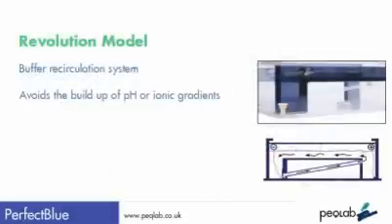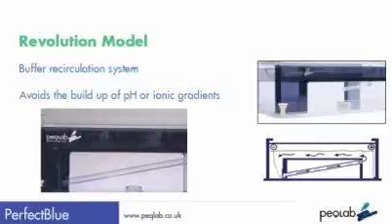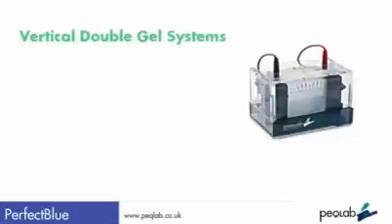From PECLAB, the Revolution models are fitted with an ingenious buffer recirculation system. This works without the need for pumps or additional tubing. Hydrogen bubbles from the cathode rise up an adjoining tube, slowly mixing the buffer, thereby avoiding the build-up of pH or ionic gradients. This provides an optimal condition for electrophoresis of maximum quality and stability.